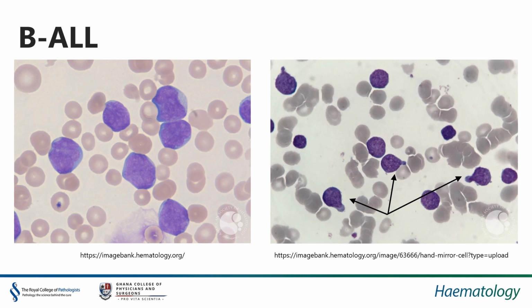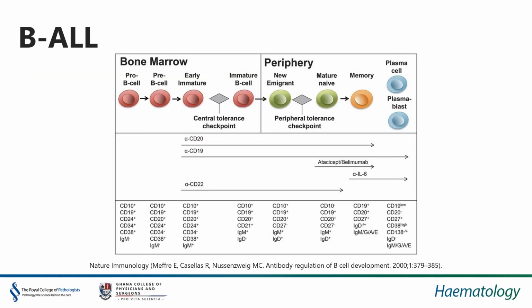So this is a cartoon schematic of B-cell development and tolerance checkpoints, with the phenotype displayed below, from the pro-B cells within the bone marrow niche to the terminally differentiated plasma cell. And we know through multiple publications where antigens are gained and antigens are lost through B-cell development as it goes through central and peripheral tolerance checkpoints and become terminally differentiated B cells known as our plasma cells.